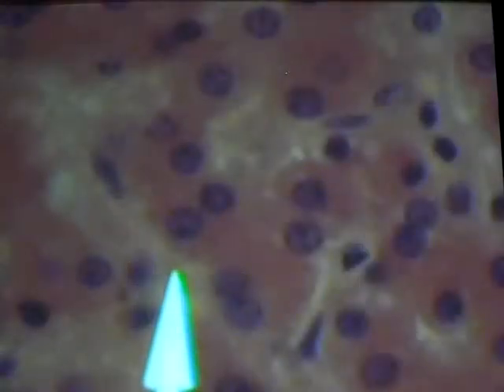Let's identify the organ: salivary gland. No, you've got to have which one it is. Like with the salivary glands, when you identify the organ, you have to say which one of the salivary glands, not just that it's a salivary gland. More specific for this example.